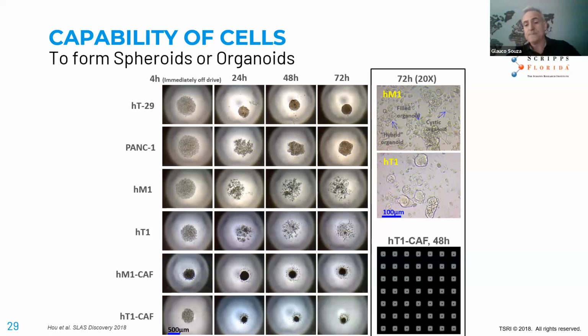They have the lumen, but it's still magnetized. You can still position them. You can still use it to change media. So you have all the benefits, but they're generating organoids. Organoids are usually made in hydrogels, but in this case, we have a specialized media. Some cells form organoids by themselves, but also you can use some specialized media to generate them.